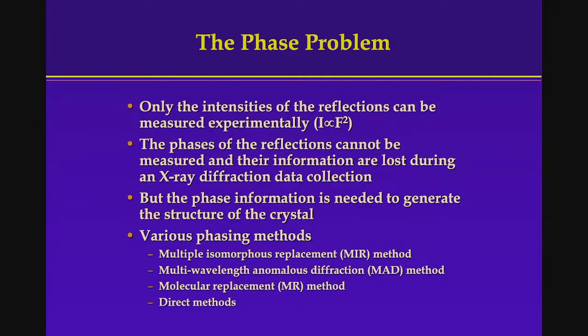I said nothing about phase. Remember, a wave needs amplitude and phase. I said everything about the amplitude. I said nothing about phase because we have a phase problem: we cannot measure the phase. Because X-rays have such a short wavelength, which means high energy, there's nothing that can focus them.